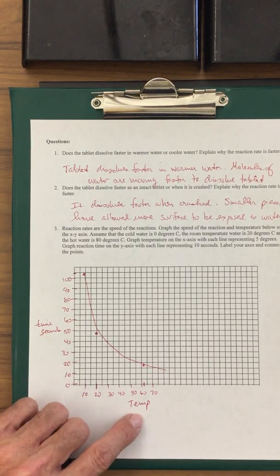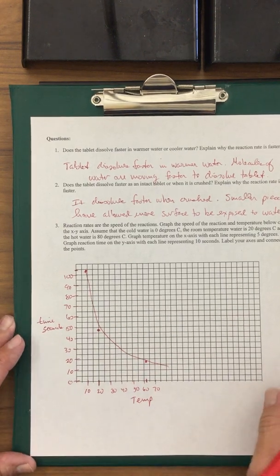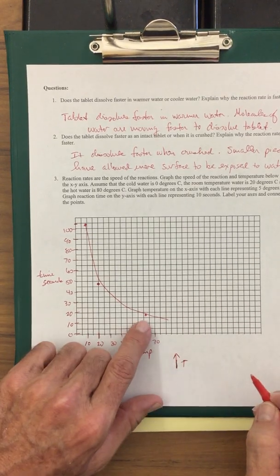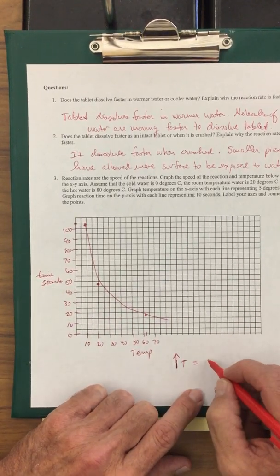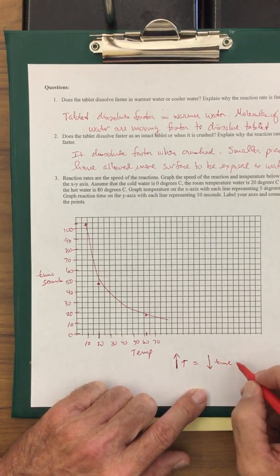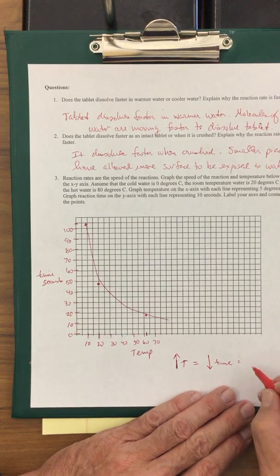So time is over here, our temperature, we've labeled our axes, and what this is showing once again is when you increase the temperature, when it's warmer, what happens to our time? We decrease the amount of time that it takes. And if you decrease the amount of time, what's happening to the rate or the speed of the reaction?